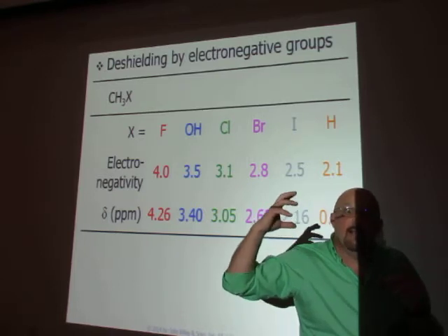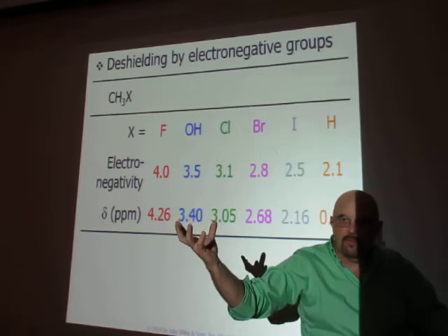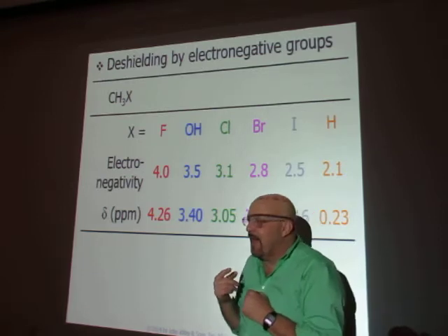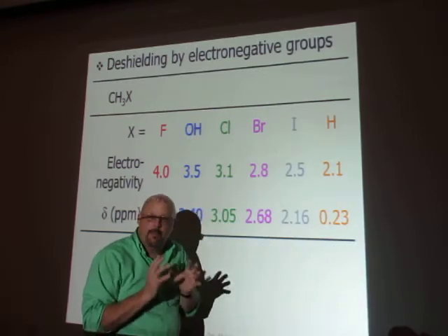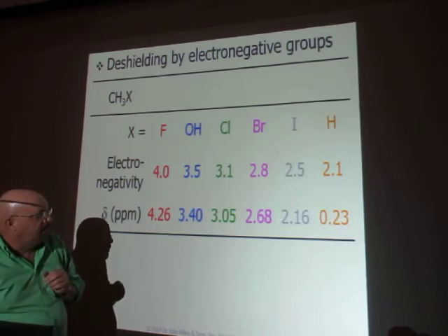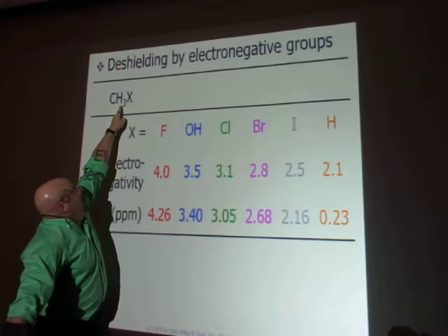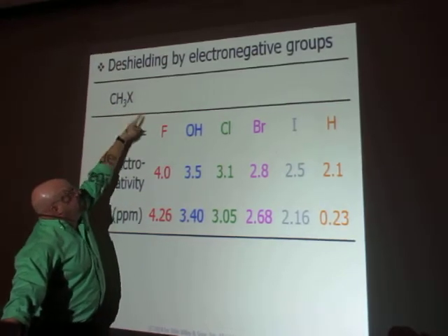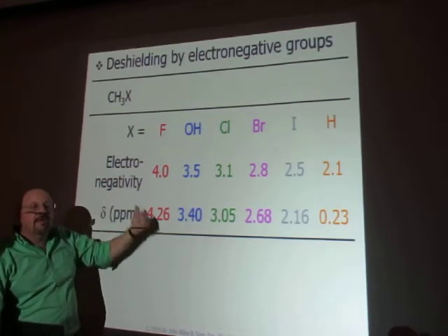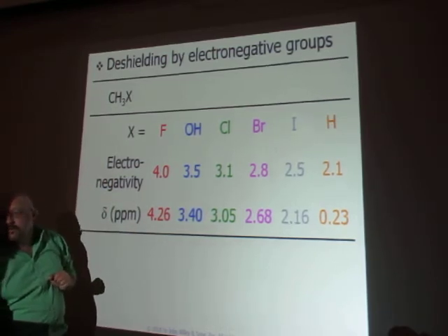It's like feeling the rain, the big magnet, and somebody spraying a water hose on you. That's the little mini magnet from the electron spinning. The more electronegative that atom is, the more of an effect it's going to be, the more they're spraying you with a water hose. So if you have a hydrogen on a carbon that's connected to, say, a fluorine, the most electronegative, then it's going to get shifted the furthest downfield. Downfield is this direction, to about 4.2 or so.